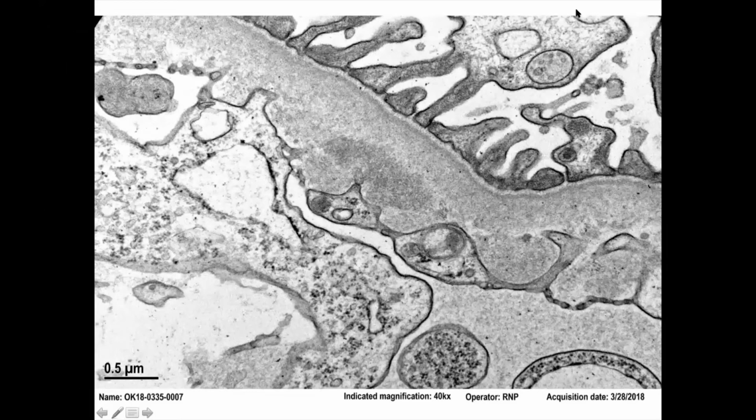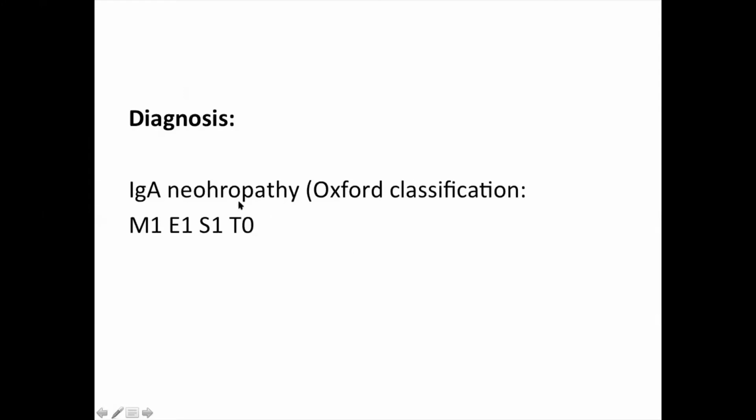So what is the diagnosis, guys? نايمين ولا قاعدين? What is the diagnosis? Yeah, exactly. Yeah. Very well done. ممتاز. Good. تمام. إنزين. So it is IgA nephropathy. All right. So this is IgA nephropathy.